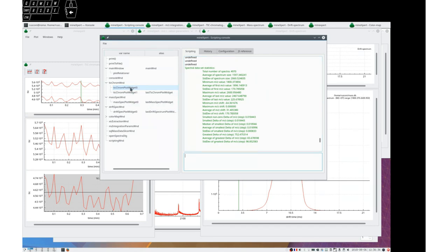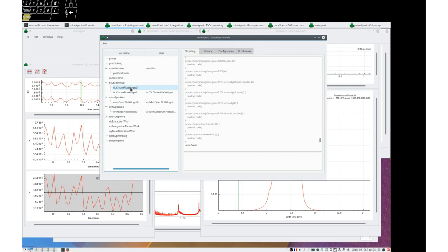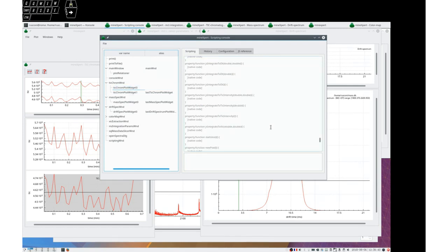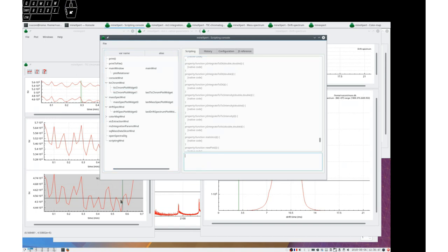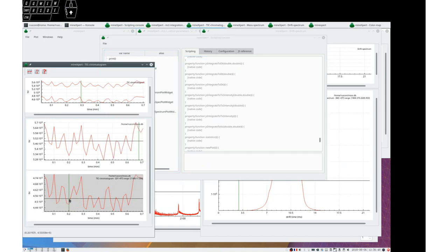Let's click that again. Control double click. What do we have? We have the JS integrated to tick intensity, for example. That is interesting. Let's say we wanted to integrate from 0.2 to 0.5.